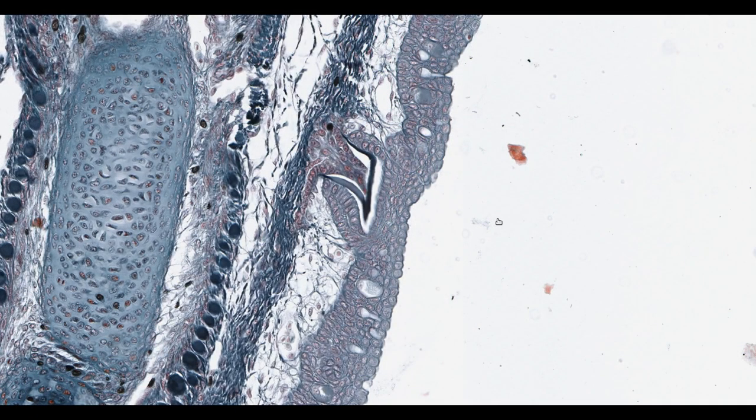Moving on from the dermis, we come to one of the main features of shark skin, the scales or to give them their full name, ectomesodermal placoid scales. We can find the best sections on slide 249 covering the pectoral fins.